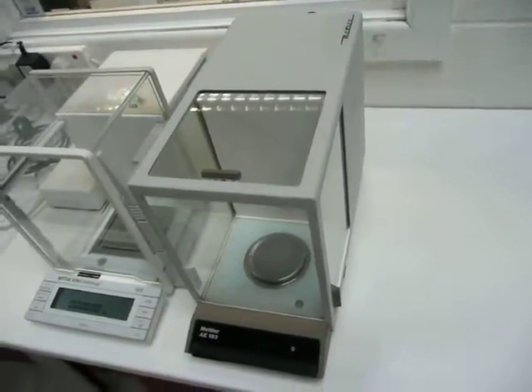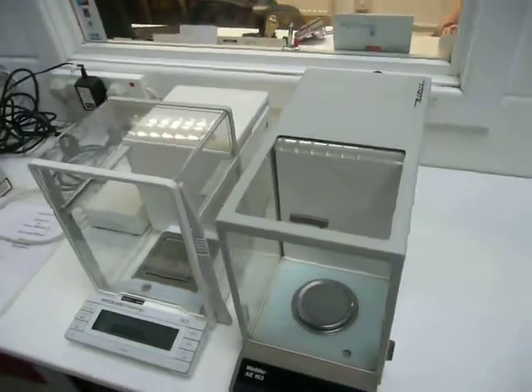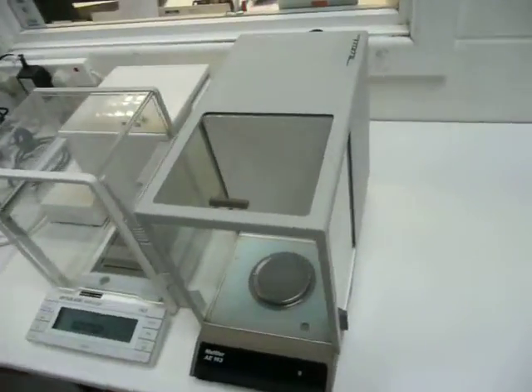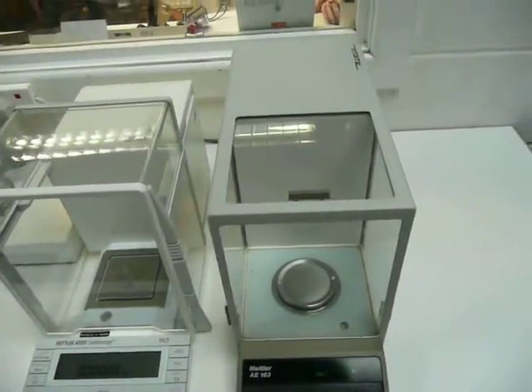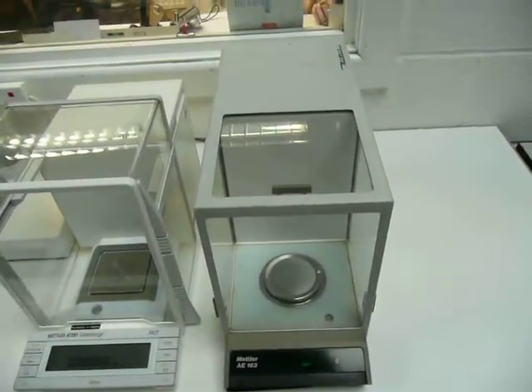This is Nick Edmund from Richmond Scientific and this is a balance video showing some latest balances that we've got into stock. First of all we've got a Metlar AE163 which is a 4 decimal place up to 160 grams.